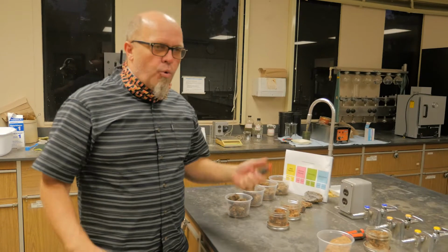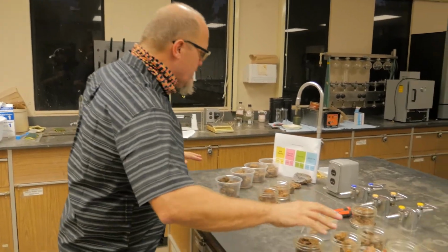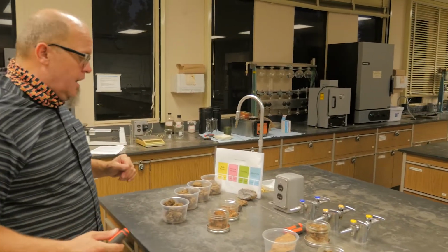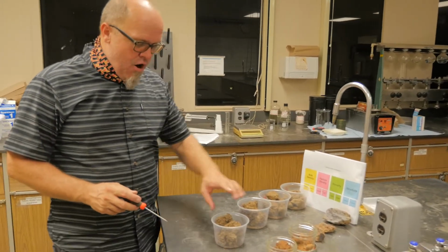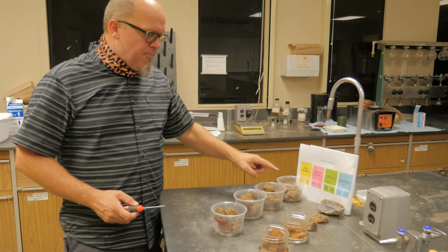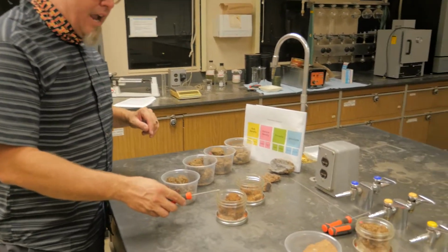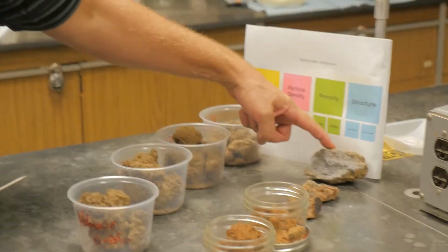All right, so here we are. We're in Plumas 333. We have an array of kind of irregular samples, and then we have samples that represent a couple of profiles really from in the field. The soils that we collected that we've been looking at the farm, we've been calling that the Holocene pit, the surface through the depth, and here's some interesting samples from up the hill around Forest Ranch. A surface soil, a subsoil, weathered bedrock, and a representation of the andesitic bedrock.